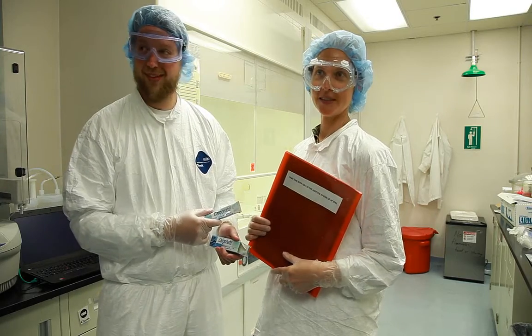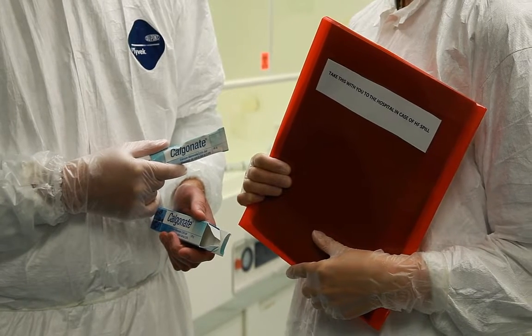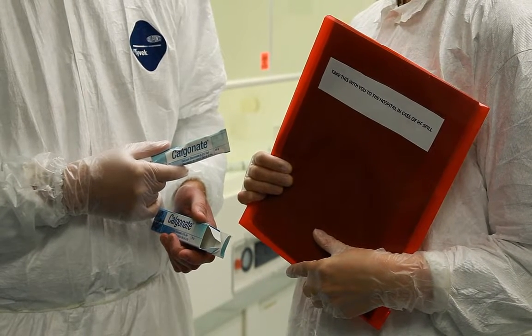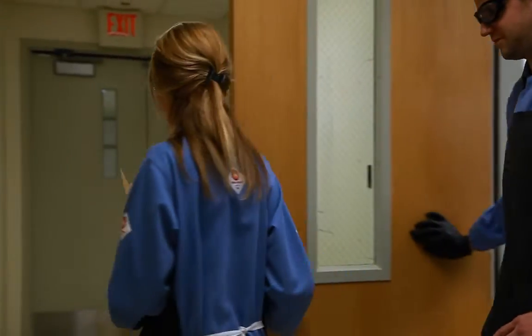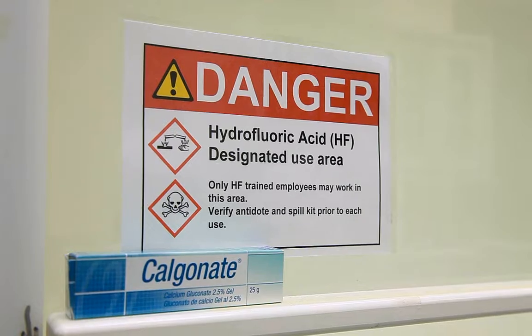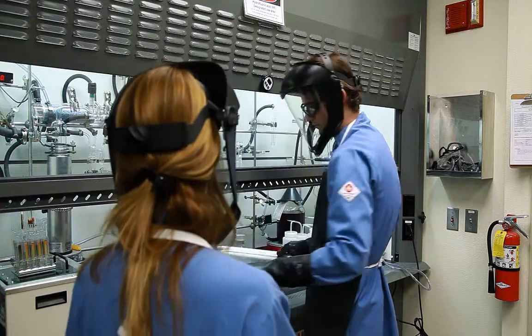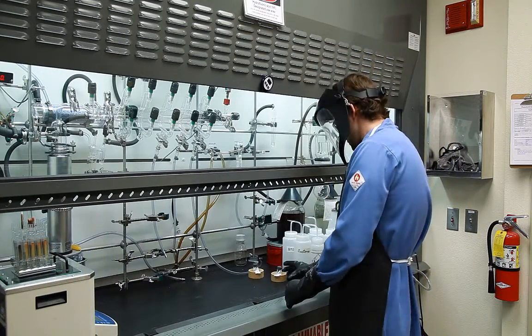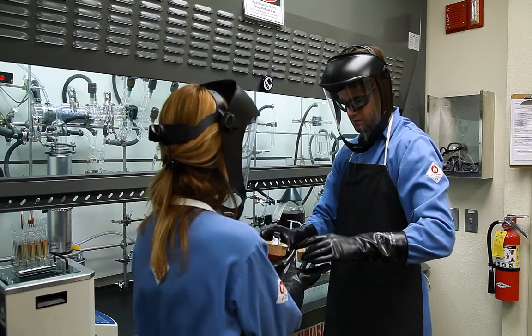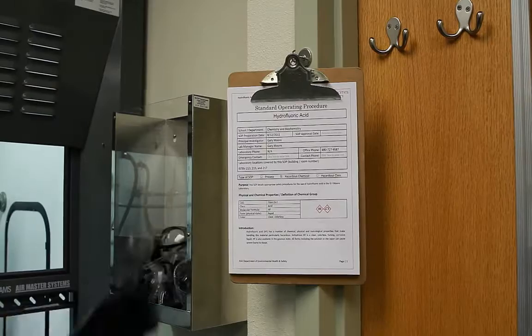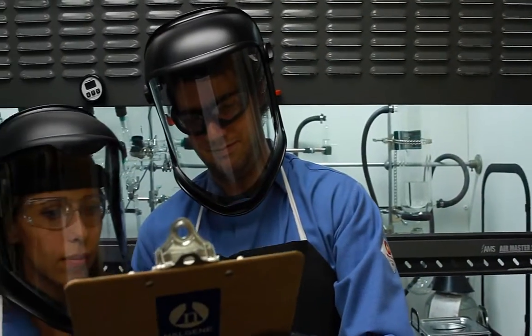It is best practice that all HF labs assemble an emergency medicine information folder which would accompany the victim or emergency responders to the hospital. Information about how to assemble this folder for your laboratory is available in the course resources folder. Verify your lab has a designated use area equipped with engineering controls for HF. All HF work must be conducted within this area. Your work area must be free of incompatible materials unless your SOP states otherwise.